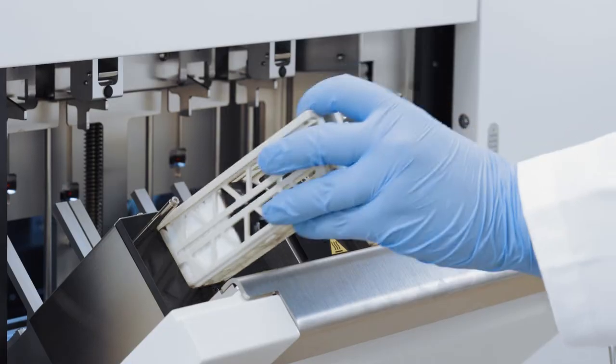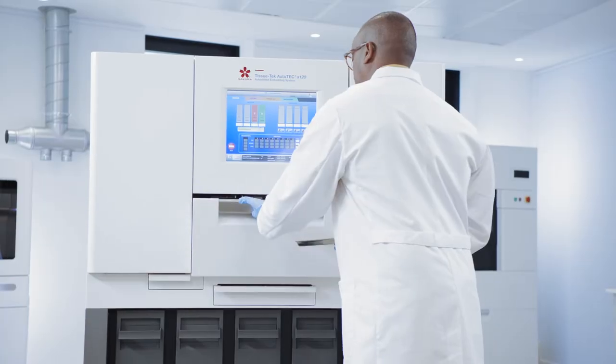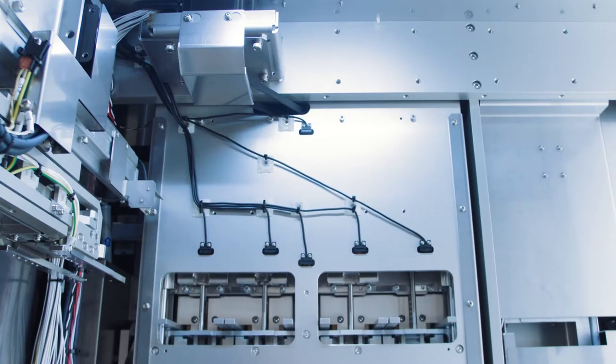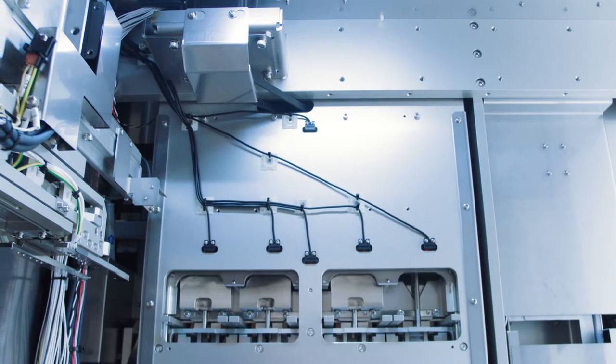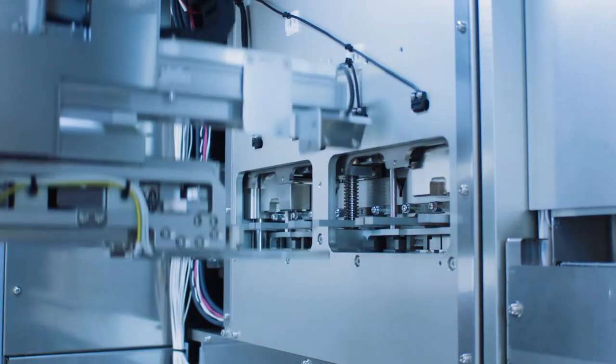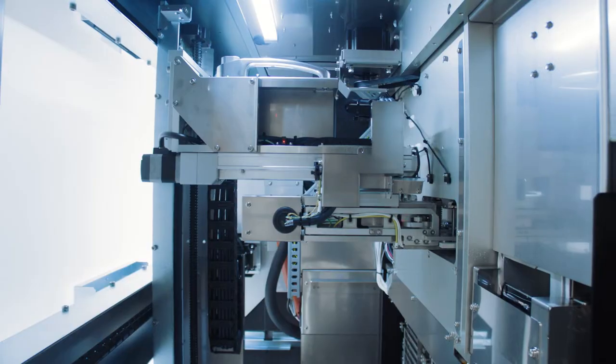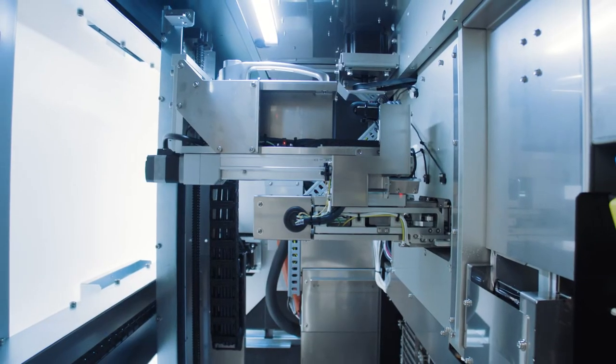That's why the Tissue Tech Autotech A120 truly makes the difference for our lab.